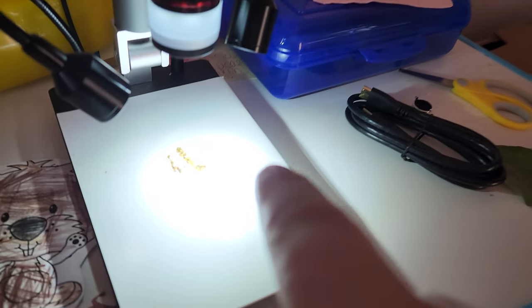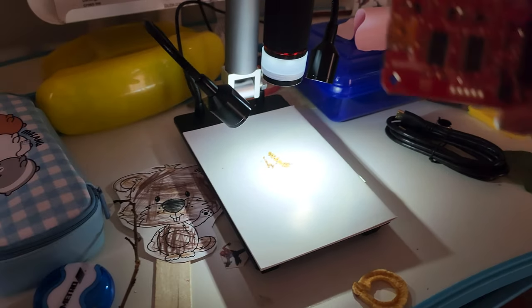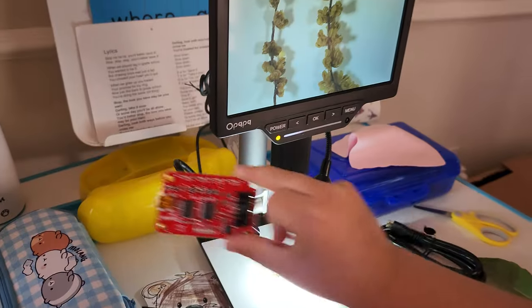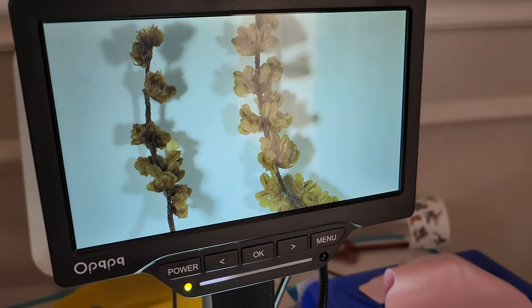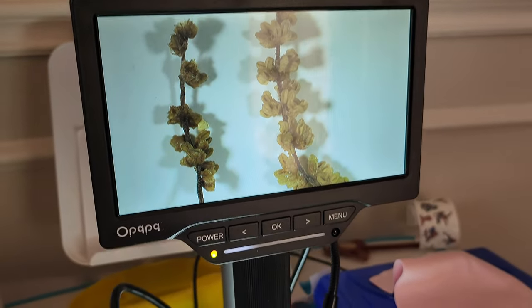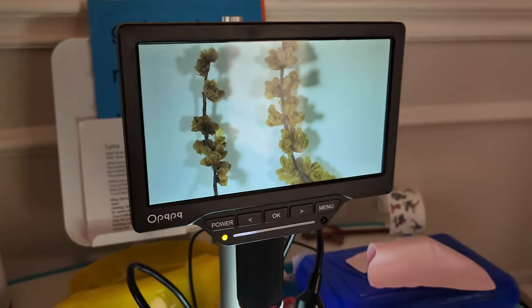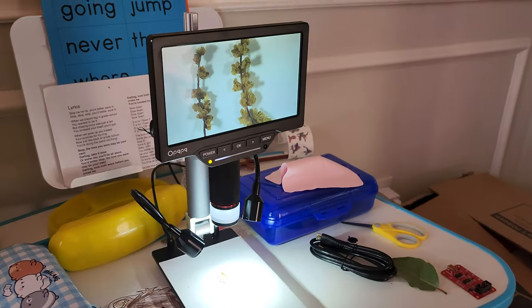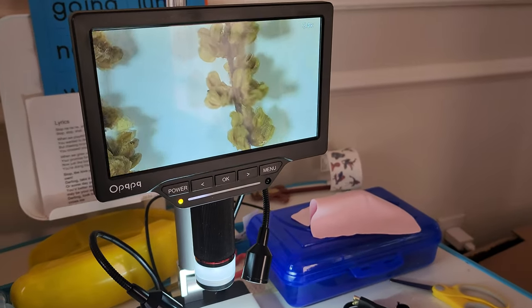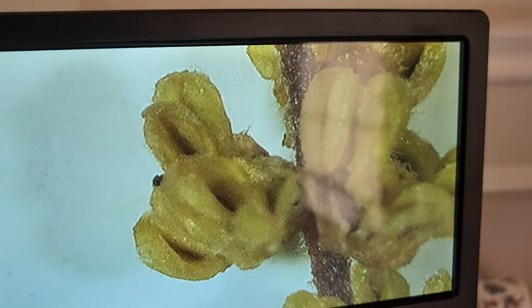My front yard is completely covered with these pollen sacks from the trees, and I thought this would be absolutely amazing to put on the microscope and show people what it looks like. And then Seth showed me that it can zoom in even further than what I knew. Seth, show me — zoom in. Do you see that digital zoom? That is insane.